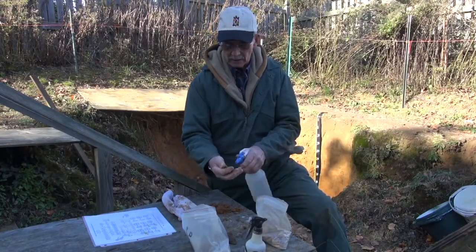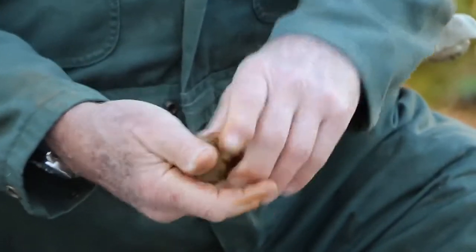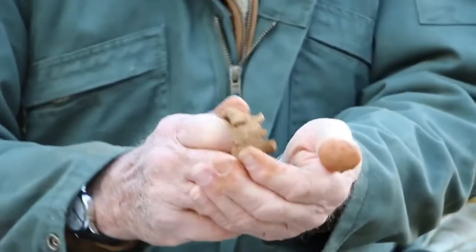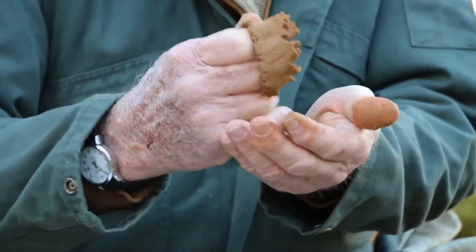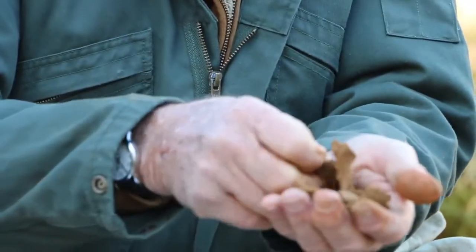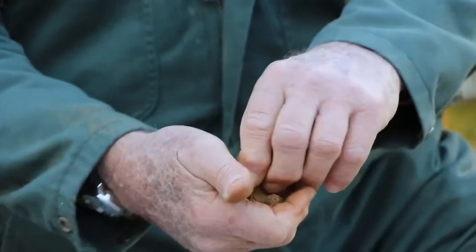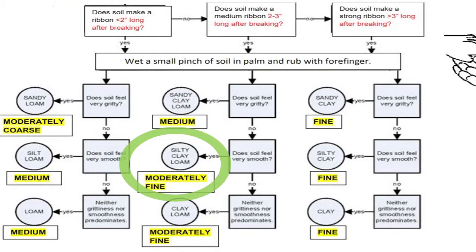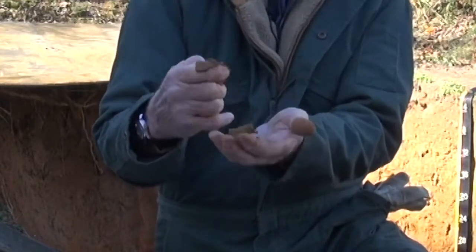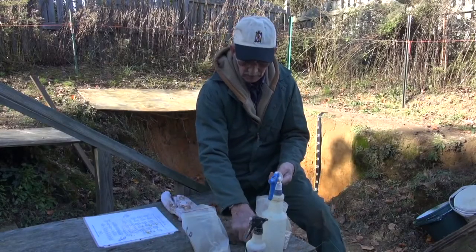One of the keys to doing texture by feel and the ribbon test is to ensure that you have just the right amount of moisture on the sample. Again, we're extruding the sample between our finger and our thumb, and in this case my ribbon is breaking off in about two to two-and-a-half inch segments. Looking at the chart, that puts us in the moderately fine category, and due to the lack of grittiness I feel here, I'd put this in the silty clay loam category. You can see my ribbon extruding and breaking at about two and a half inches — this would be a good example of a moderately fine.